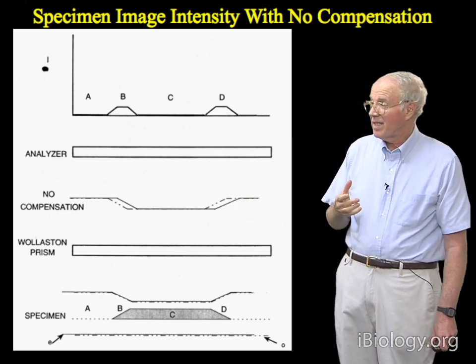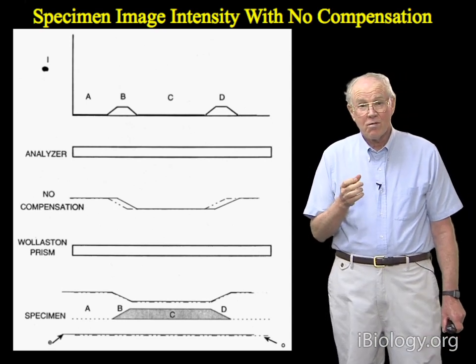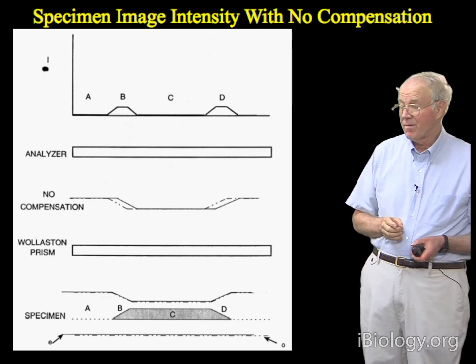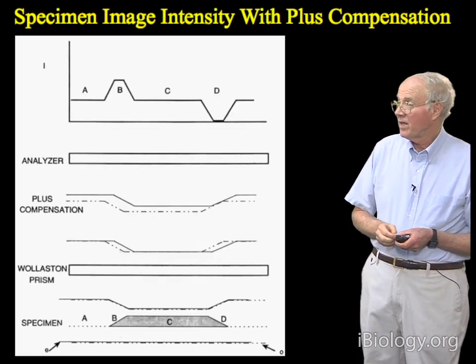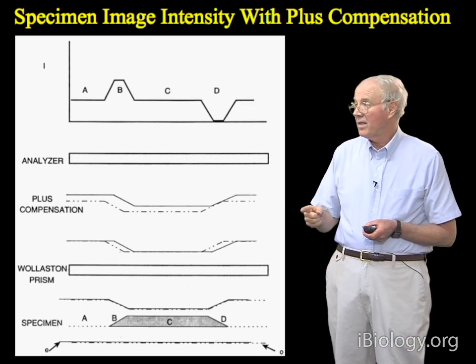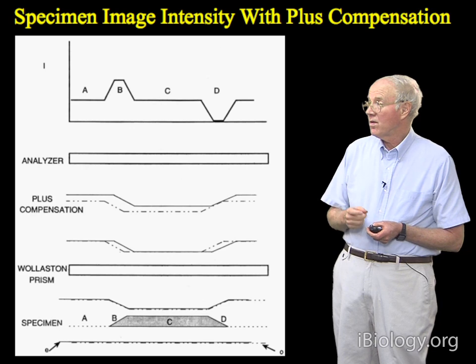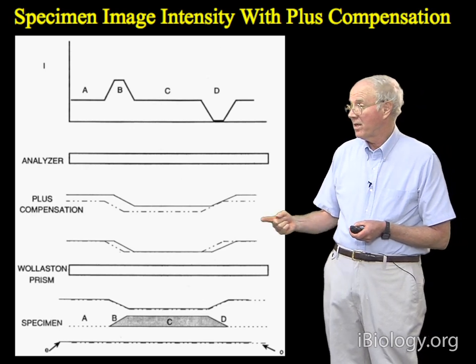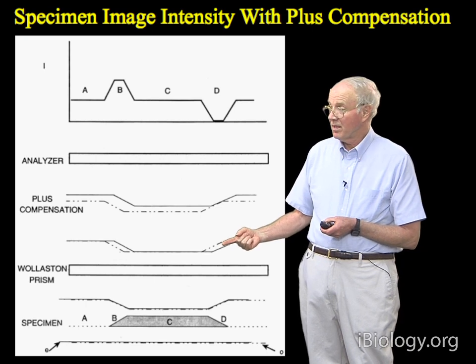And it's not a very easy image to look at, and it's a very dark image. And so we normally use a compensator in the DIC microscope to advance one of the wavefronts over the other in order to brighten up the background. So if we go back, here we've got the embossment that takes place at the image.